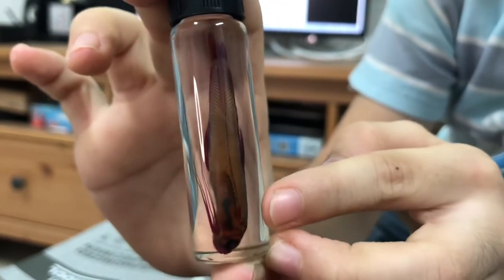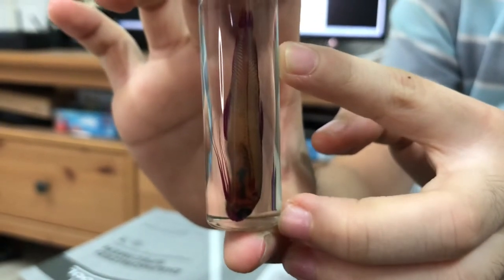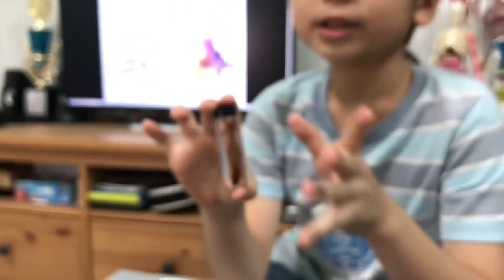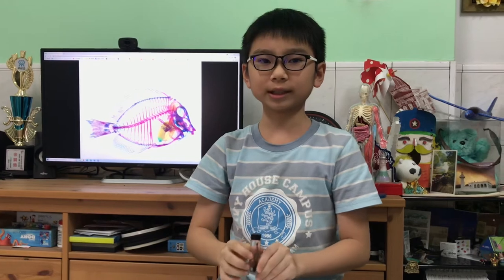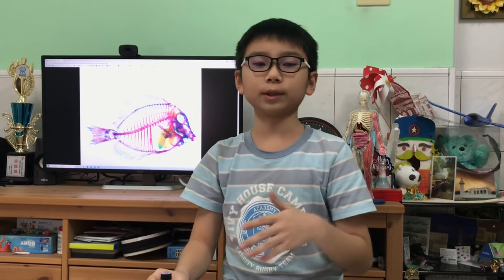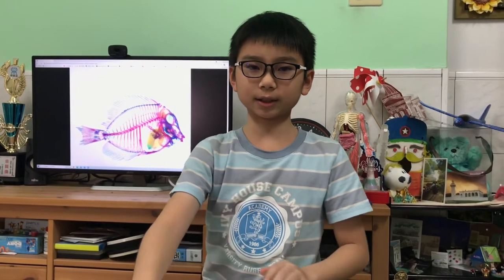You can see a bit of yellow, which is the fat in its body. So using diaphomization, you can do things like counting a fish's bones. Or, for a bigger specimen, you can also see how it works its jaws or how it swims with its fins. And that is how you use diaphomized specimens.